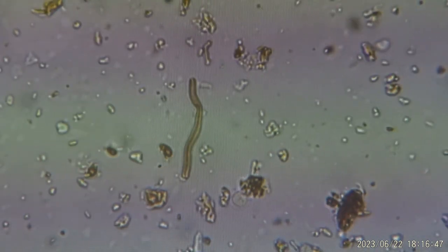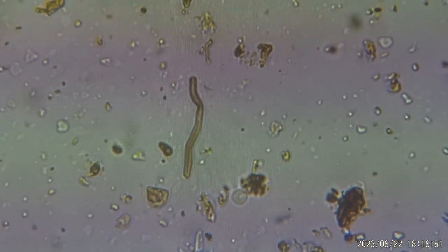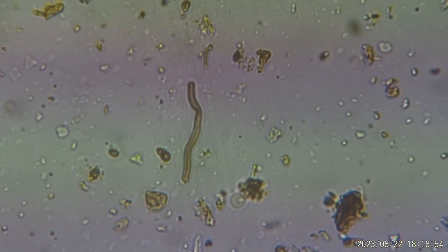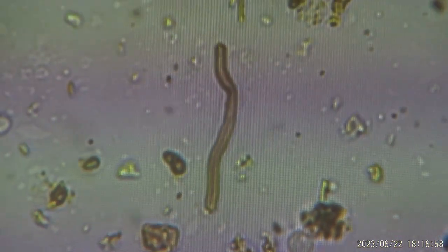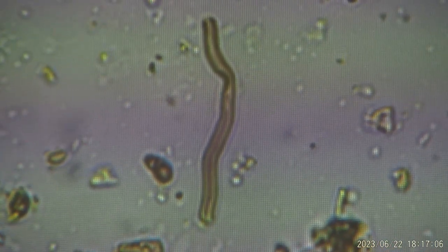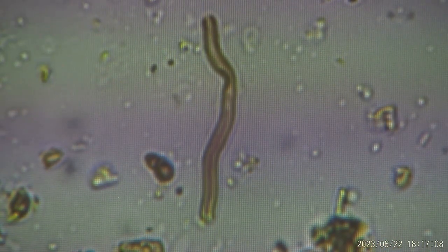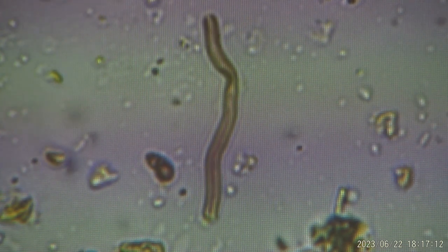So this filamentous organism that you're seeing there, that is a fungi. This is something that we didn't see in the previous soil sample, something that we want to be seeing all throughout, really, in the soil, and as much as we can. The more melanin that you see, meaning the more color that you see, it's typically a sign of a more beneficial fungi.